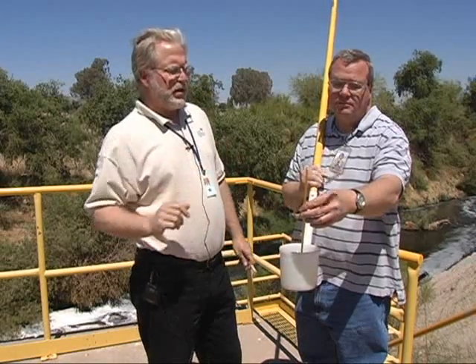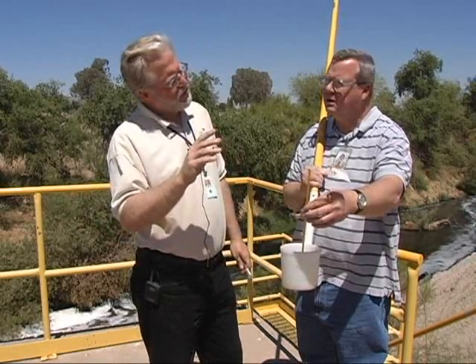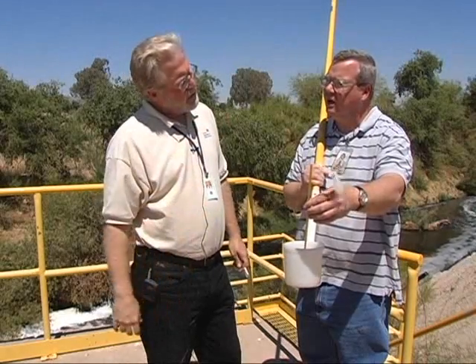So when you're reading the thermometer, do you try to guess what it's going to be if it's between the lines? We're going to round up to the next line — or round up or round down, depending on how far up it is.